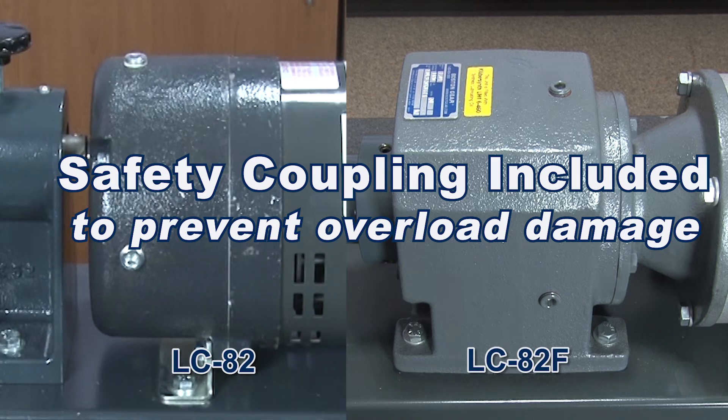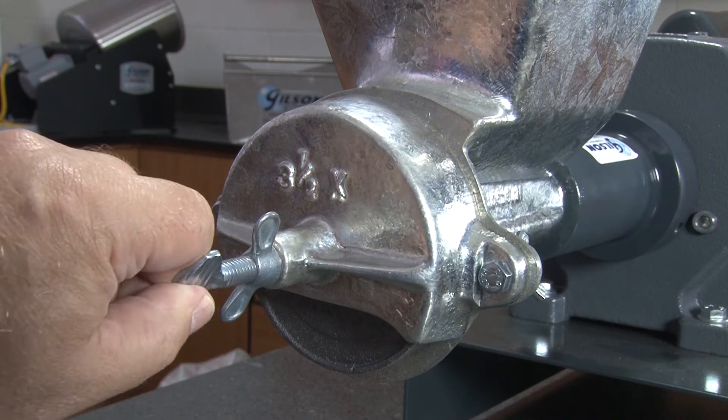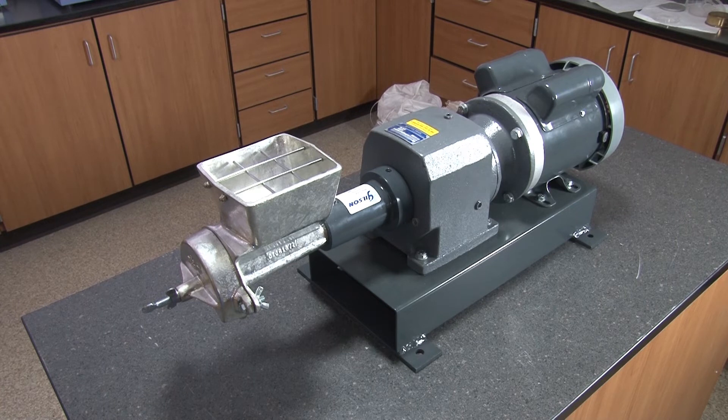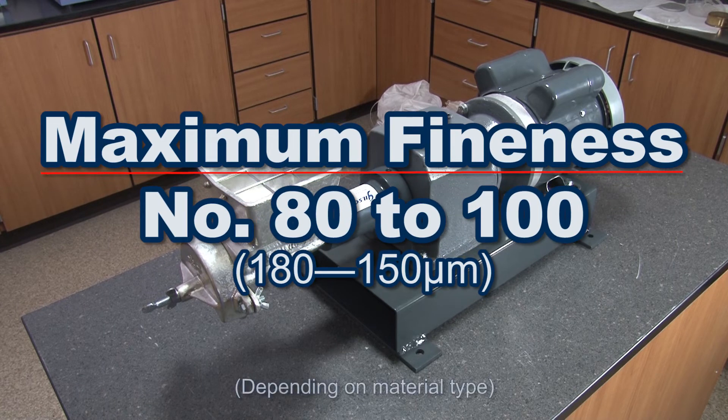Plate to plate clearance is easily adjusted by hand, and in one pass this rugged unit can grind material to number 100 particle size.